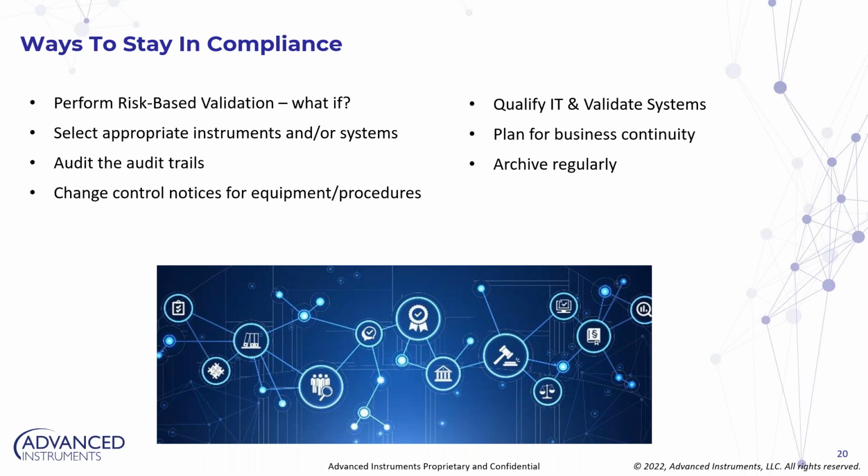And you obviously also have to do audits, right, on the audit trail. And that's something which will also be easier based on the choosing of the right analytical device into your lab. There's also change control notices for equipment and procedures that you have to do. There's working with your IT to qualify, validate the systems. You always have to think about the future.